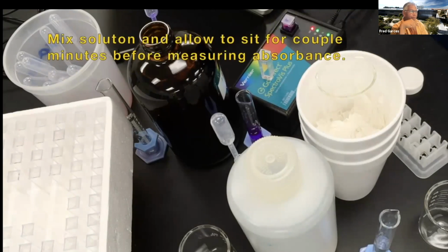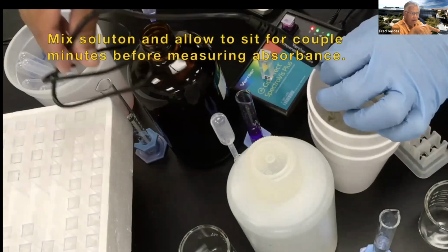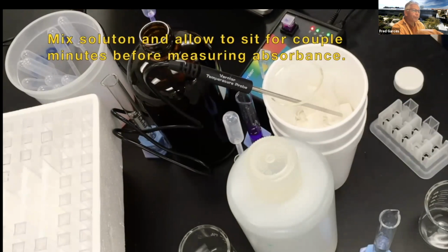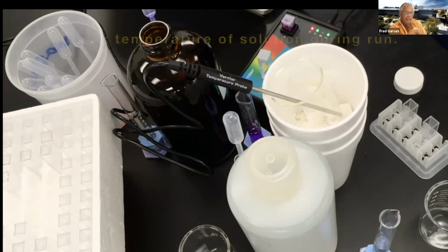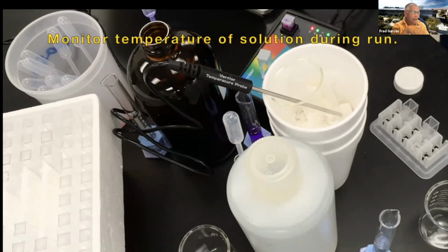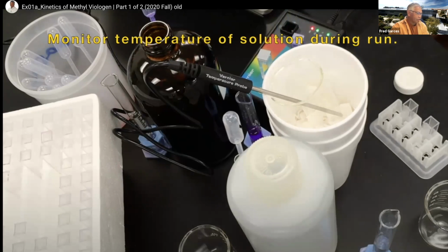So here I am. You can see the cuvettes right there. I put the beakers in a styrofoam cup because the wind drift in the room made the temperature fluctuate. By putting them there, I'm adding some insulation, and I put a temperature probe right here in that solution. That way I know what temperature my solution is at. So you monitor the temperature while the solution is running. And again, you can scrub through this if you get super bored.